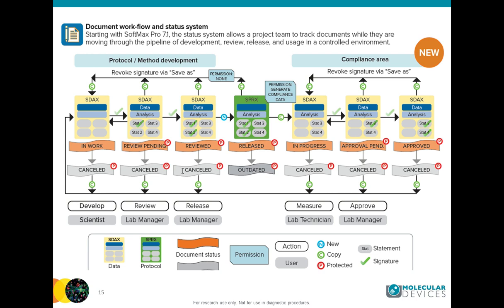On a closing event of the file, if the content of the file changed, a copy of the document will be automatically exported out of the database. And you can define as many locations and as many file formats as you want to have exported on a file closure event. This applies to the right side of the workflow.